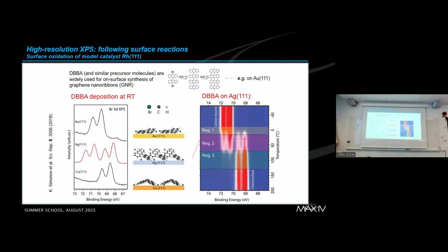Well, there are different cooling and heating systems. For example, Alexander recently installed a very fancy system with a laser. So there is a laser heating the back of the sample. At this beamline, we are not that sophisticated. We are using filament heating, plus we can apply high voltage, but this is no issue.